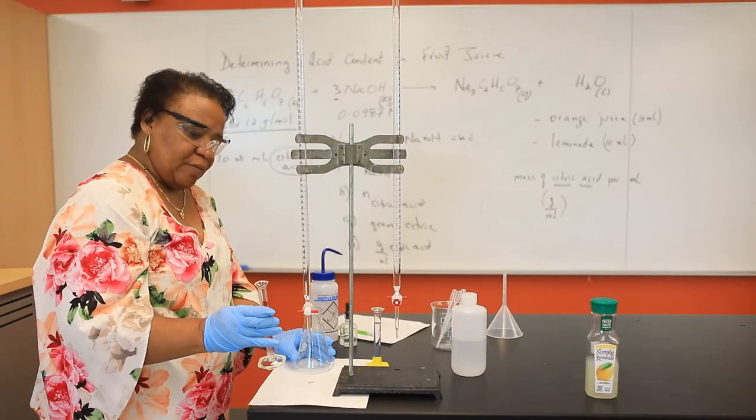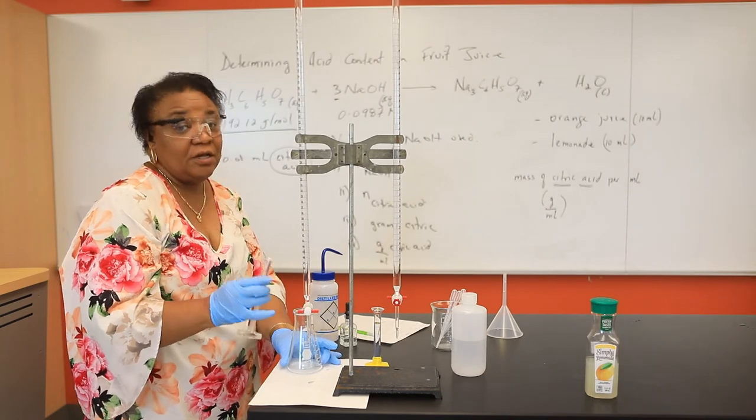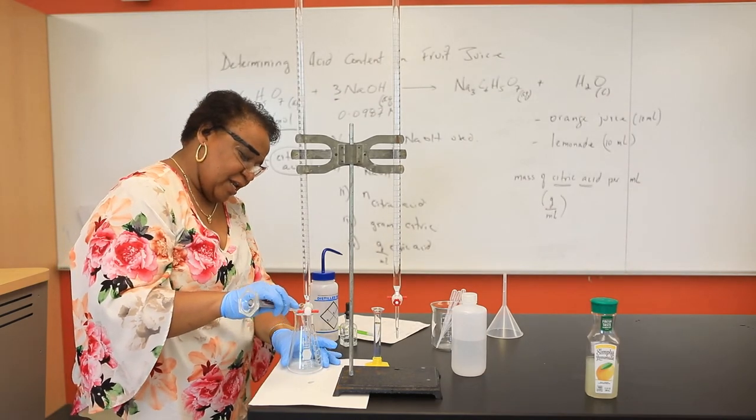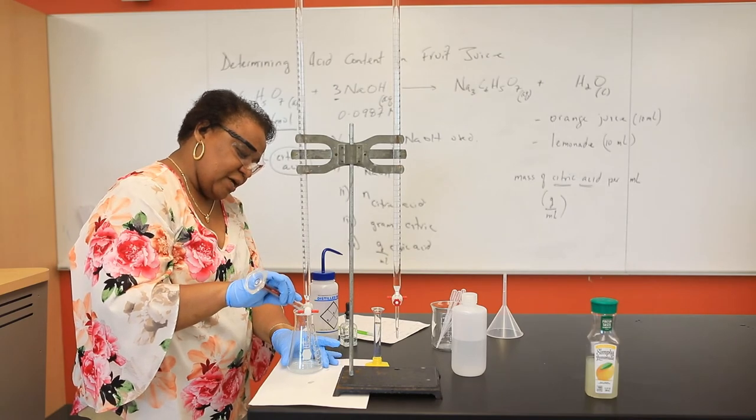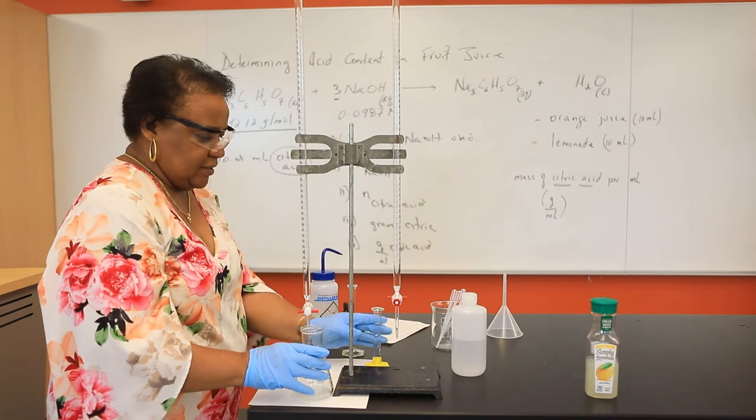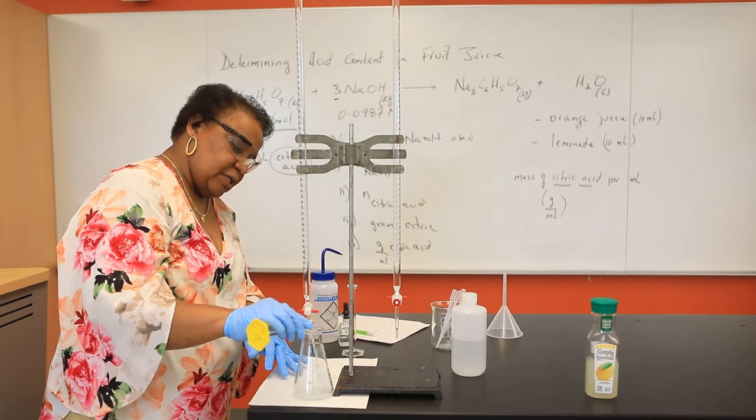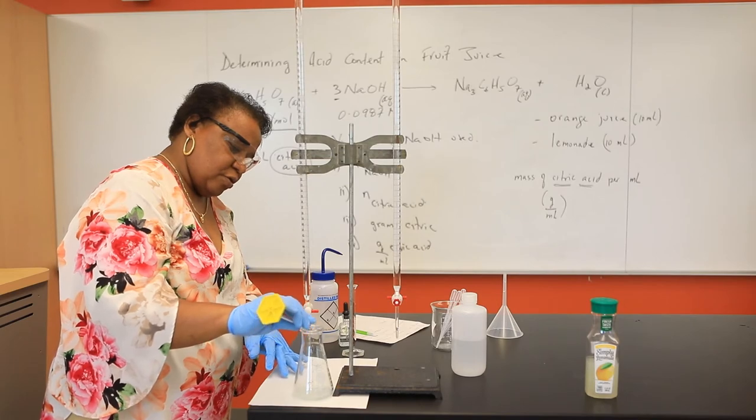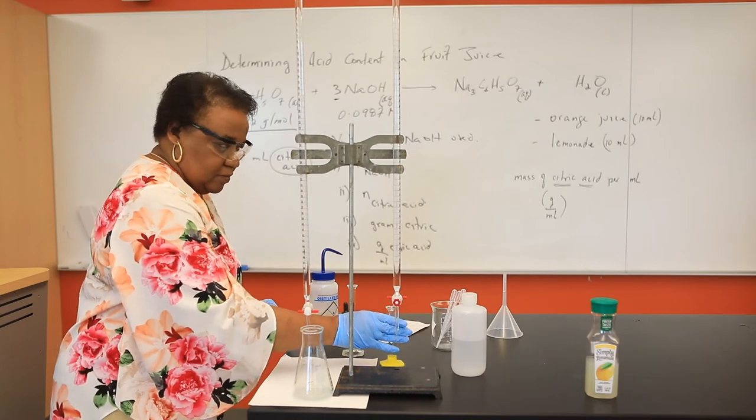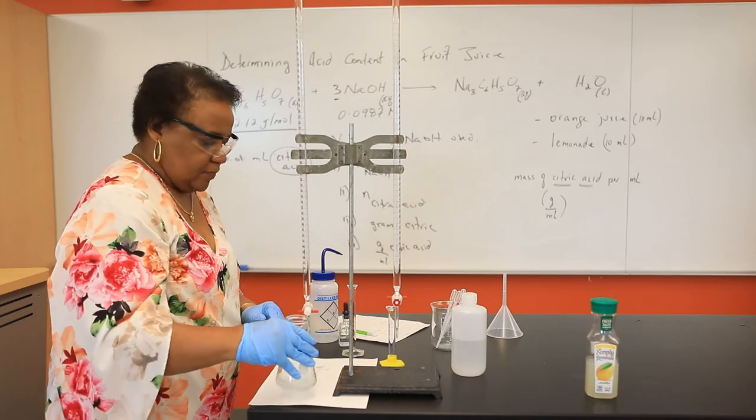The second part of the experiment, we're going to be looking at lemonade. I have pre-measured 10 mLs of lemonade. I've transferred it to my Erlenmeyer flask. And to that, I'm going to dilute my solution with 10 mLs of water.